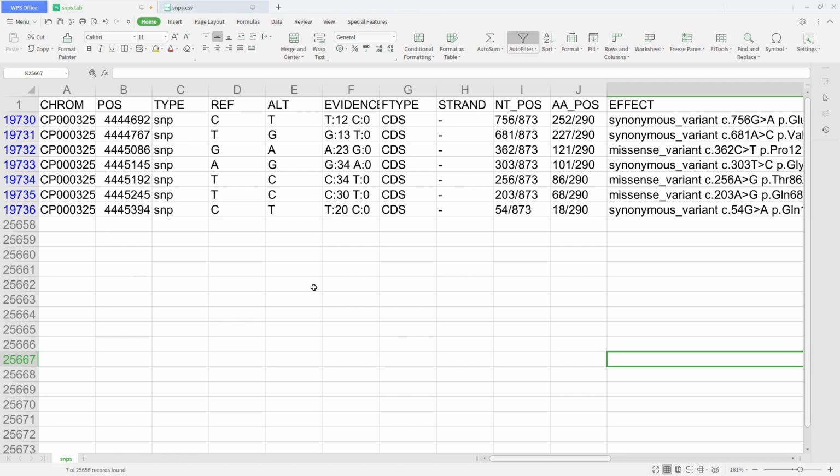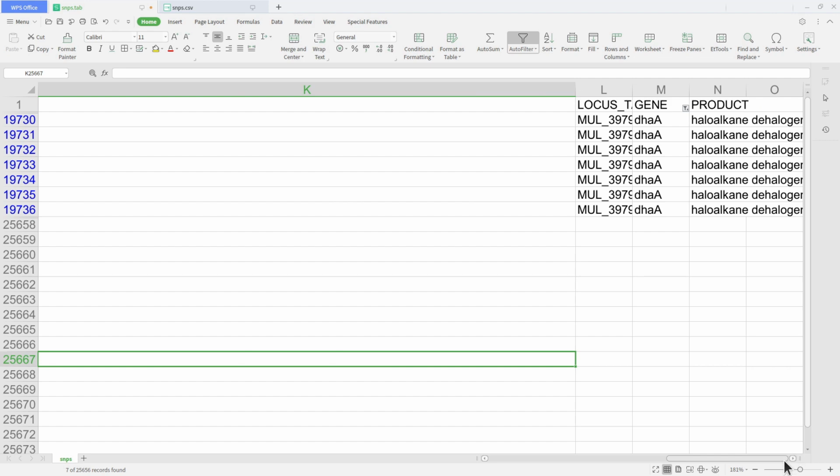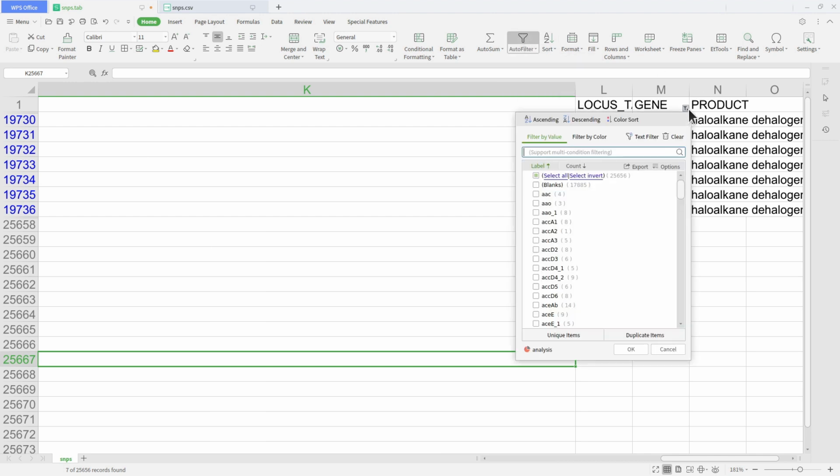Let's check. Okay, I think I used DHAA. It's fine, let's just change to DNA. It should be somewhere here.